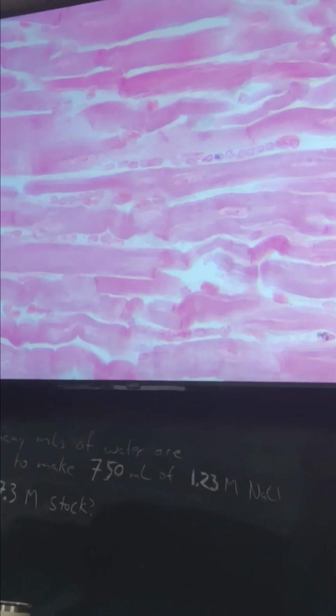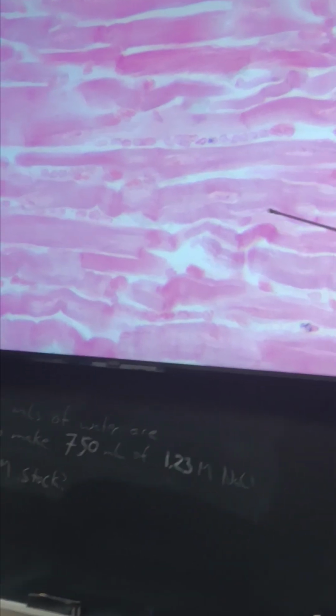And so if you get the right kind of view, if you do some searching, you might see something kind of like this one, which hopefully you can appreciate right here. Just that little part, and a little bit on the other side, but especially right here, it's not as darkly stained. You guys kind of see that? There's a little clearing right here.